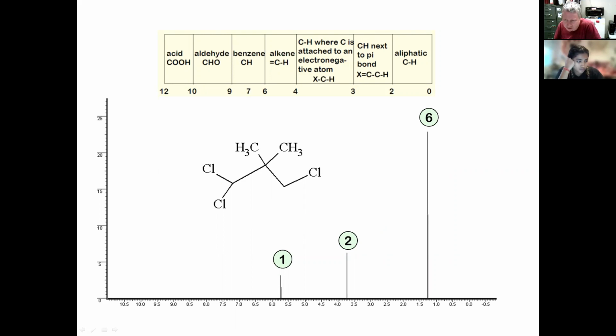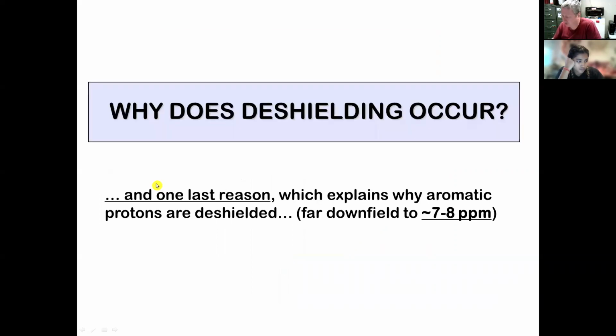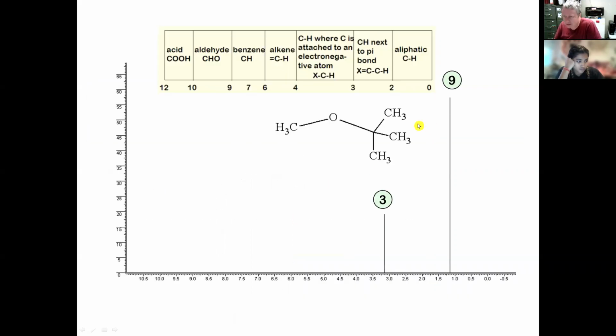So the carbon shields the effect of the oxygen. That's on the last one. Yeah, somebody said, does the carbon shield the effect of the oxygen? Let's go back. Yeah, a little, enough. Yes, basically. The oxygen is separate. These carbons can very minimally see that oxygen. It's kind of far away because this carbon shields them.